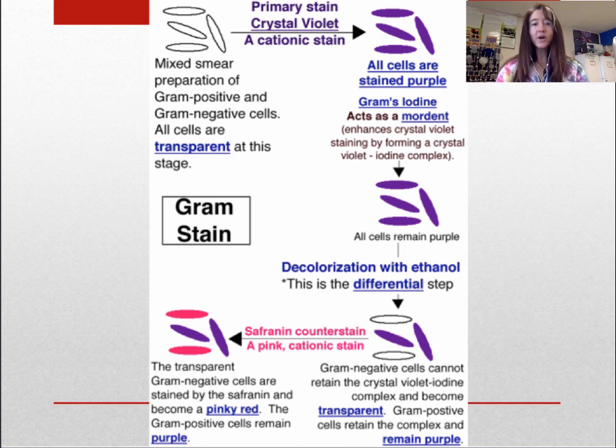The stain that you're going to be performing in lab is one in which your gram-negative cells are Escherichia coli, E. coli. Gram-negatives tend to hang out in our gut. Gram-positives tend to hang out on our skin and in our nasopharyngeal area. So things like E. coli are gut bacteria, whereas things like Staphylococcus epidermidis, that epidermis, right, is our skin cells, that is something that's a normal flora of our skin.